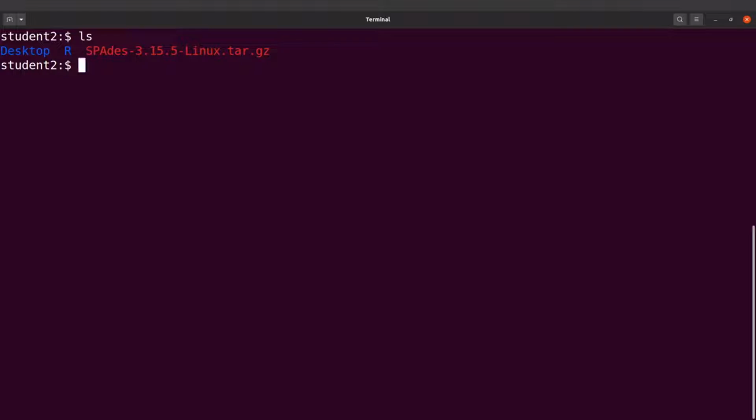So this is what we are going to use. Now, let me say that this approach we are using is useful for those who don't have root access or who don't have admin accounts on their respective Linux platforms. And most of the time, you may be working on a remote server or you may be working on a Linux system where your account is another account. So if you have another account, then there are restrictions as to where you can store files. So this approach will help you to set it up using your home directory.